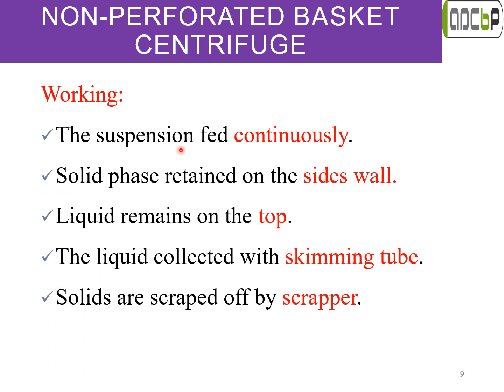Let us discuss the working. Now, these non-perforated basket centrifuges are loaded with the suspension or the slurry which is continuously fed, and the non-perforated basket is set into rotation with the help of motor.